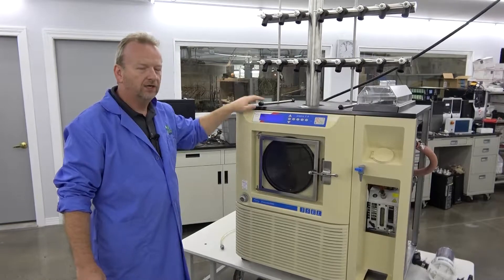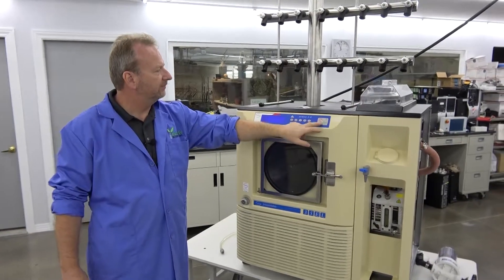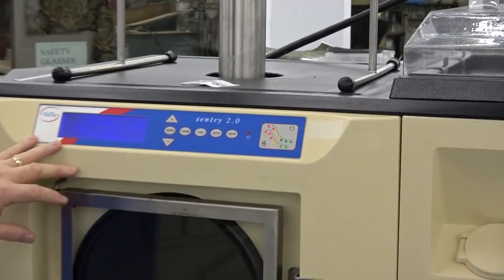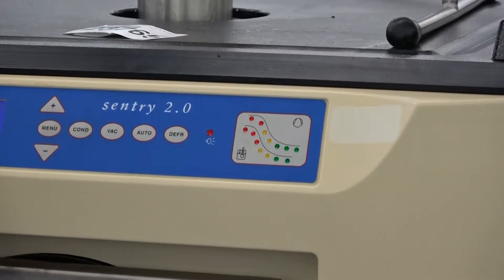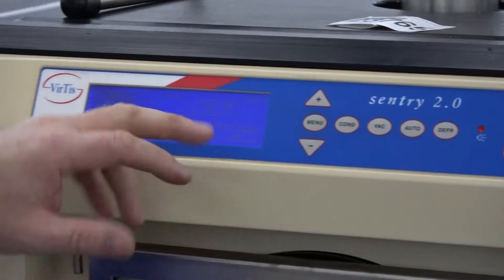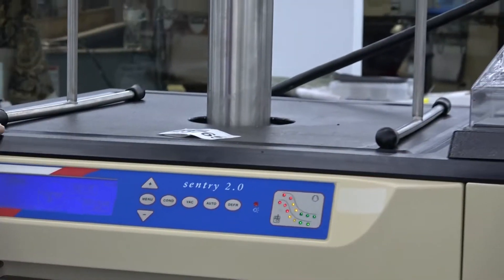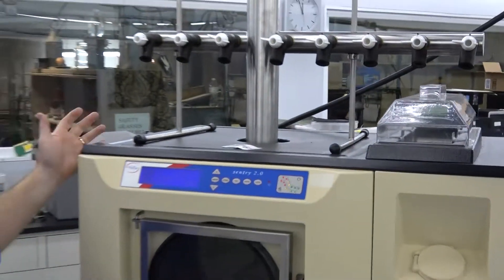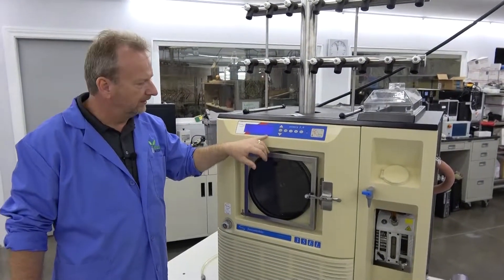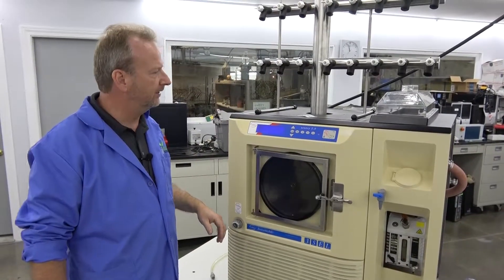Right now I've had it running for probably 20 minutes, so it is all down, pulling a good vacuum here. You can see the screen — it's at about negative 70 degrees Celsius on the inner chamber, and then it's at negative 65 up here right now in the bath chamber. Everything is running right now, the vacuum is on. We're down at 9 millitorr on the vacuum. We've got a good seal in the chamber, some serious evaporating going on in there.